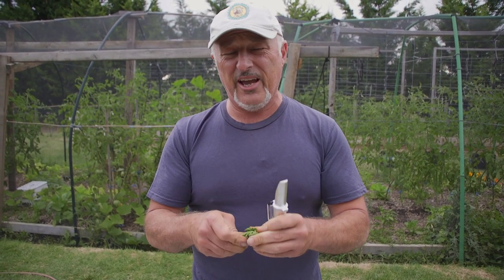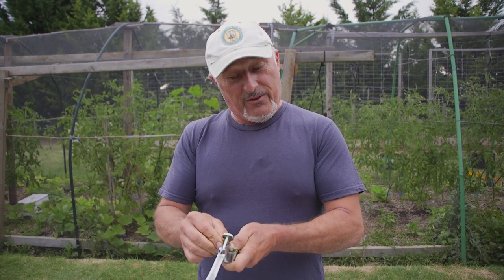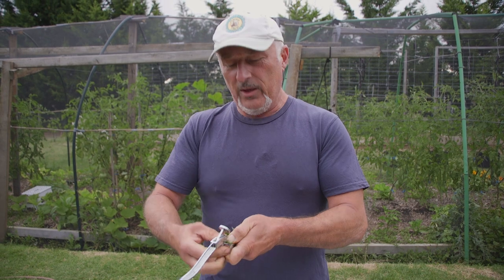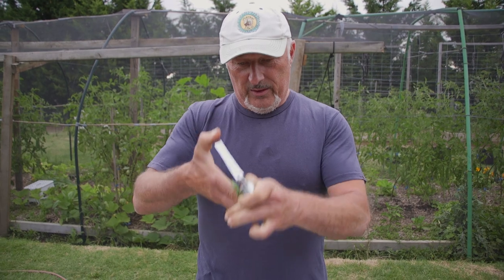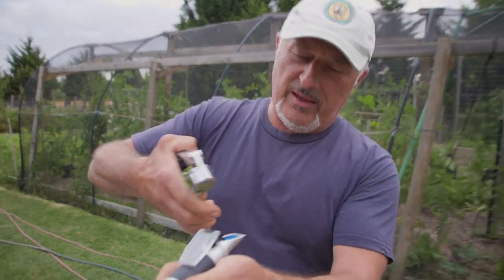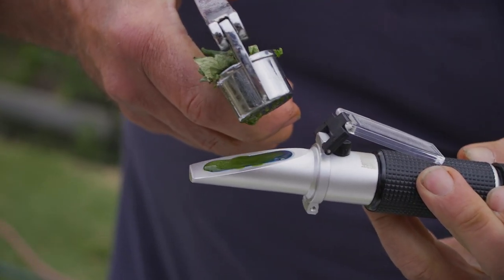The science behind it really needs to be considered when it comes to gardening. If you're having struggles in your garden and you're not sure where to look and what to do, well you start with your pH - that's our four-in-one soil survey instrument - and then you go into the refractometer to test the nutrient density.